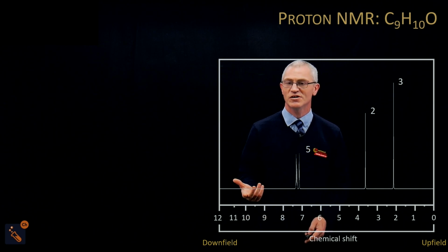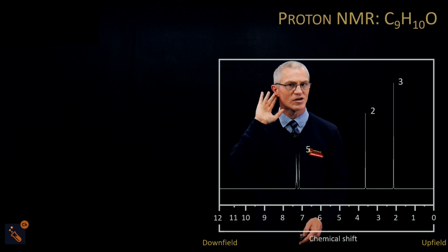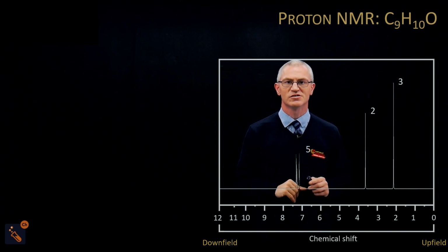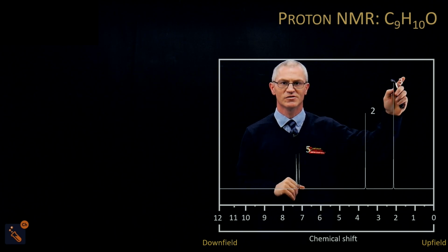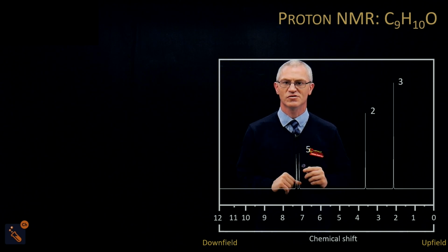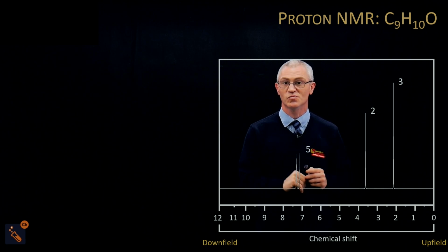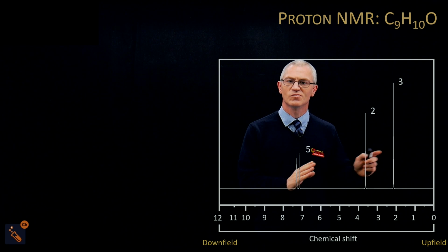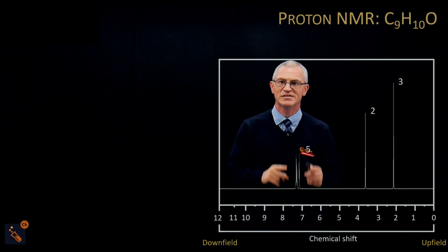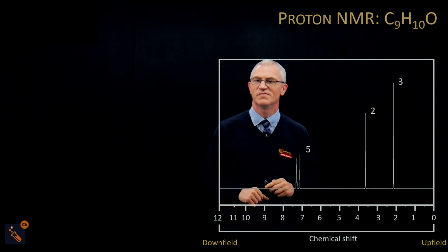Any other one with just 1 oxygen is a ketone. So let's keep that in our mind: there might be a ketone. We've got a CH2 and we've got a CH3 here because of our relative peak areas. But they're next to a carbon with no hydrogens on. So we know the carbon next to these two peaks has no hydrogens on. We think it's a ketone, and we know that about these two peaks. We can see we've got a benzene peak right here, and we know it's mono-substituted because of the 5.